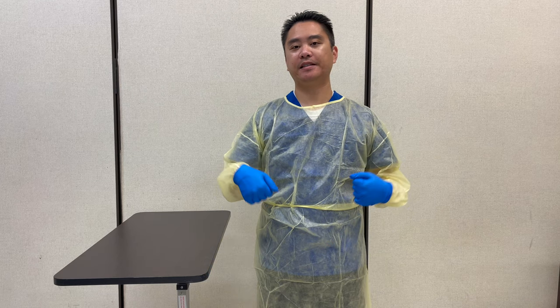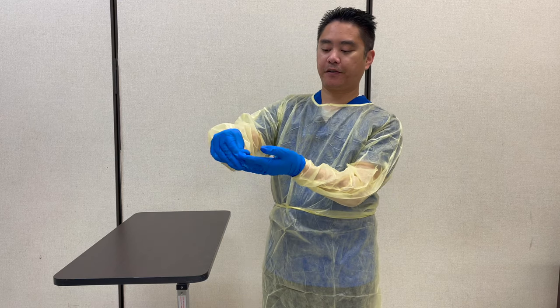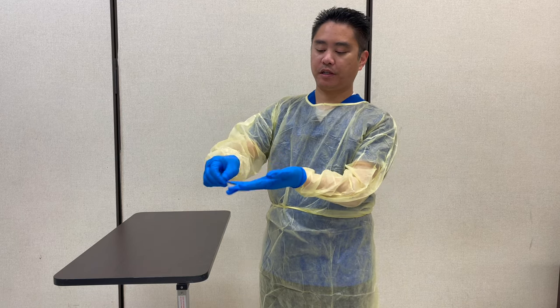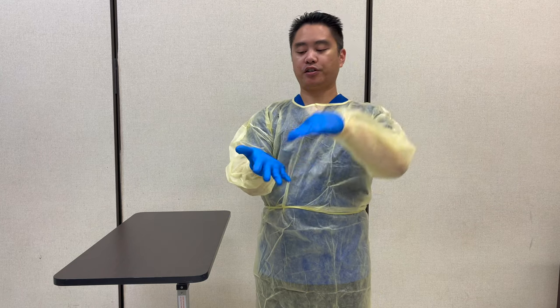And then I can do the procedure. Once I'm done with the procedure, I have to remove the gown and gloves inside the room by the doorway. So I start with the gloves first. Make sure that there's a space so I don't touch the gown.